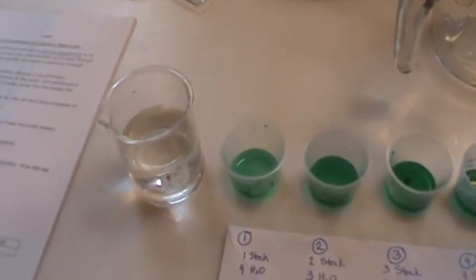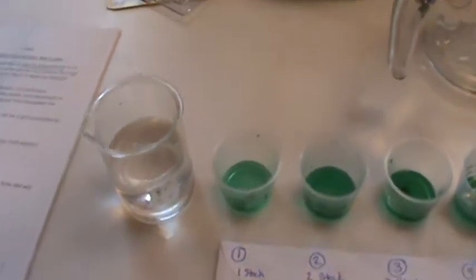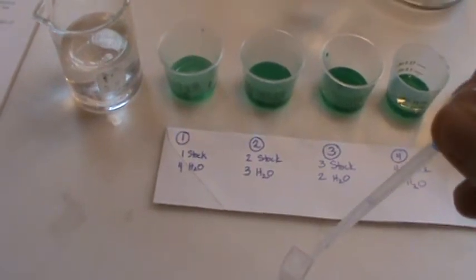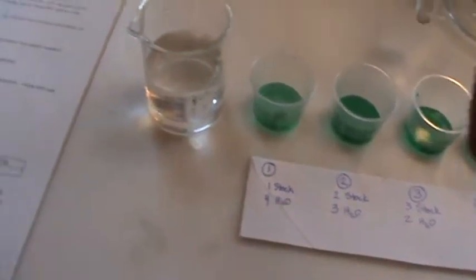Okay, and then what we're going to do is we're going to always begin with a 0 point. So I'm going to use the disposable pipette here to fill this. There we go.